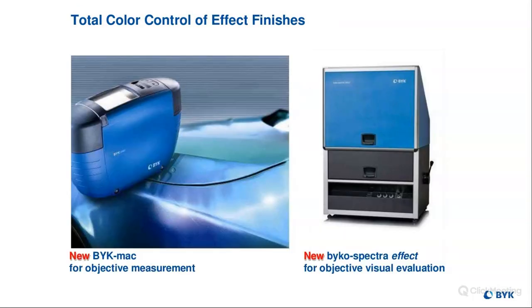I know how the interior has kind of a floating panel in there that you put the sample in, then you can check it at various angles. It's a very cool instrument. So basically, that top part of it folds out, and so it essentially creates a roof over you, and then this felt material surrounds you so that no outside light can interfere with what you're seeing.